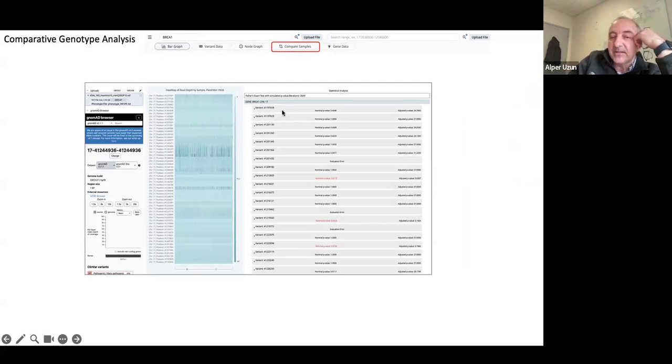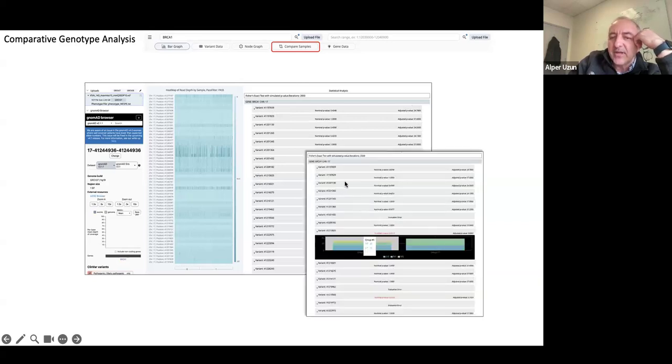And you can see the variant information here, and their adjusted p-value and then nominal p-value. If you click any of the arrows here, you can visualize the number of genotype information and comparative analysis, if it is significant or not, for the homozygous, heterozygous, and homozygous alternative.